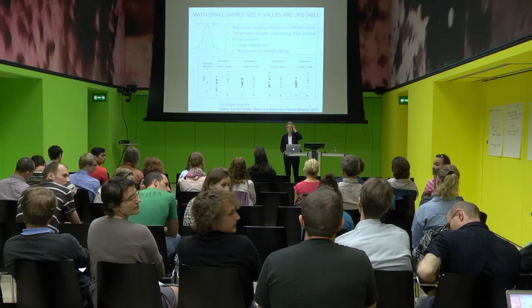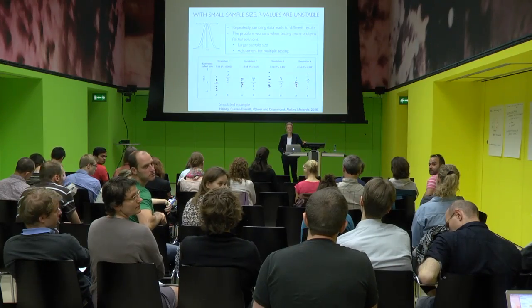About the pooling, so I was wondering whether you can sort of quantify the benefit from this. So say you had 100 samples, but you can only shoot 20. So you can either choose to pool or you can choose to pick 20 out, right? So can you say in a sort of power analysis kind of way how this increases?